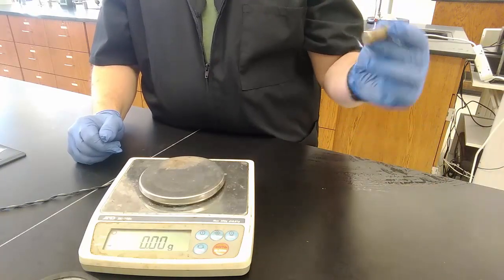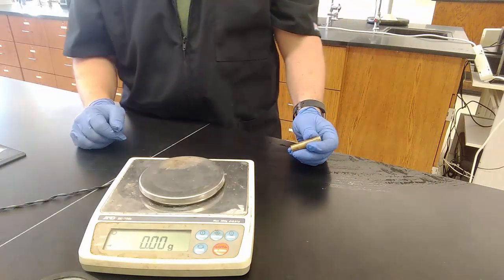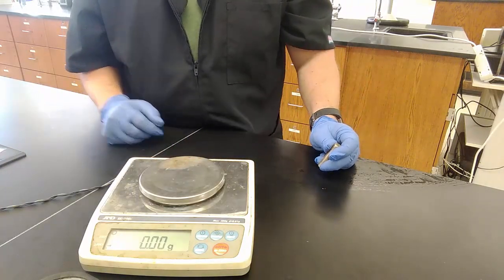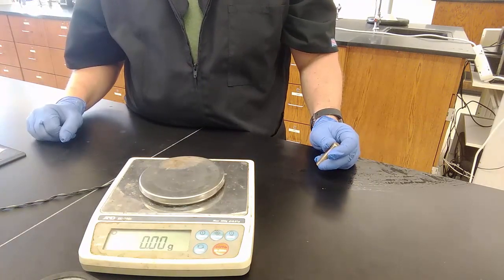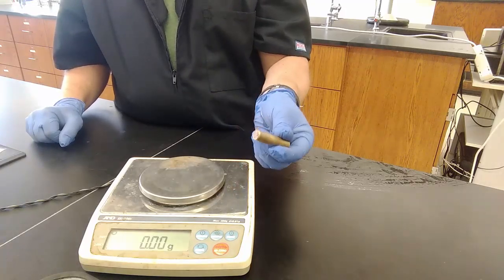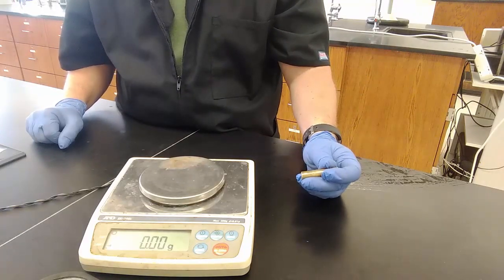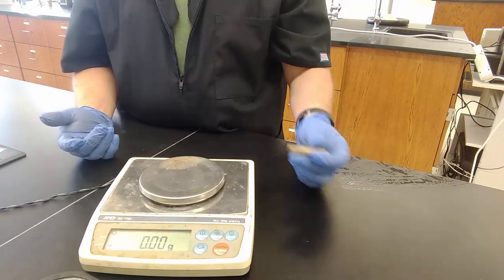So from the density of this bar that you will have calculated, either from the sample data that your instructor gives you or made up data that your instructor gives you, or I suppose you could have written down the numbers that I called out in here, then you could flip back to table 1, where there are a variety of gases, liquids, and solids listed with their density. You can only look at the solids for this one because obviously it's a solid, and you can figure out its identity likely. I don't say that you can absolutely figure out its identity because it's one data point. Maybe you can confirm its density.